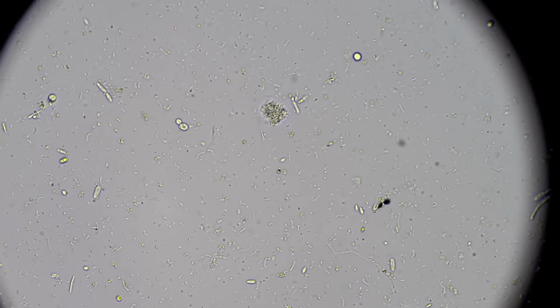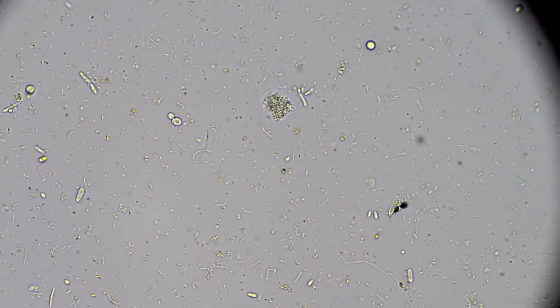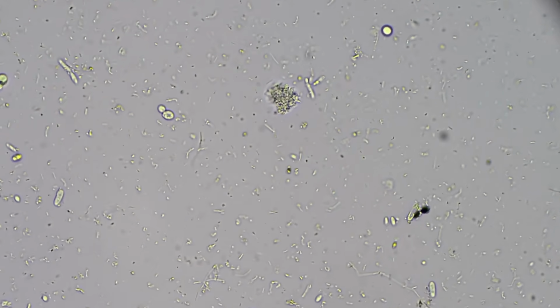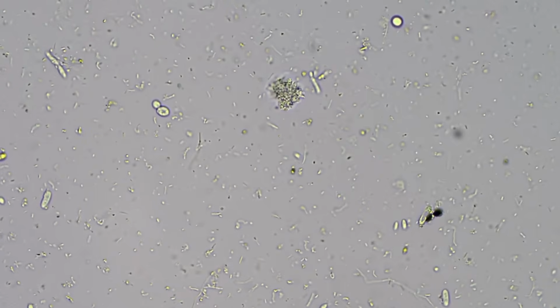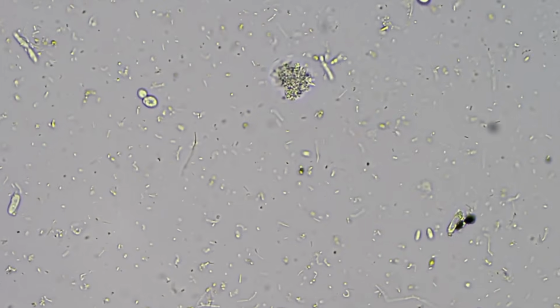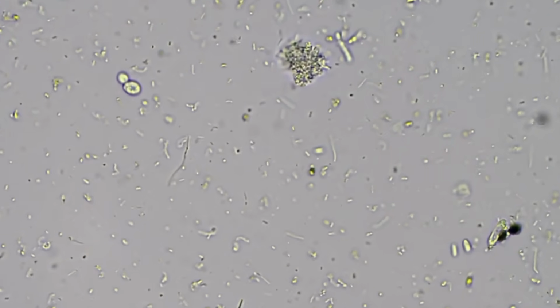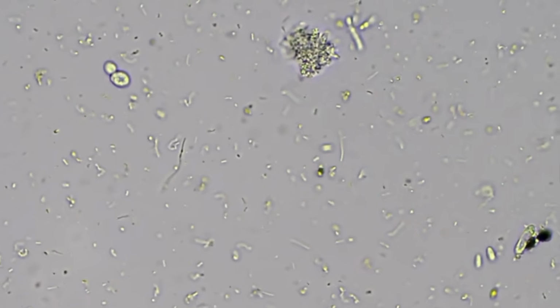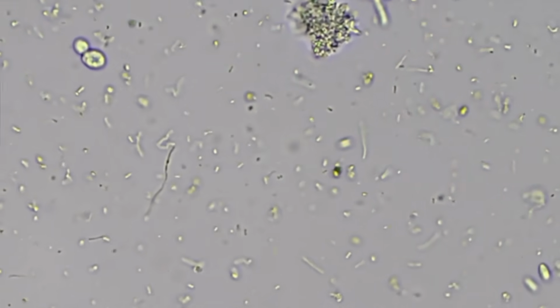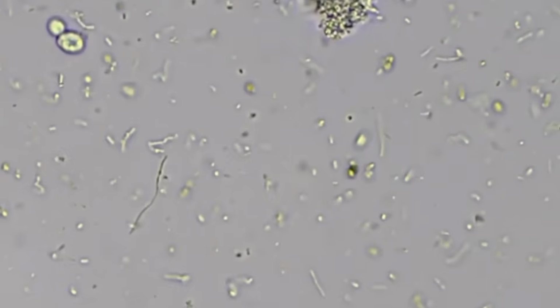But when they are vibrating against each other, that is horizontal gene transfer. They're conjugating. When they're spinning around each other and they spin off like pirouetting, kind of like in the middle right now, they were just spinning right here in the center. They're gonna look like they might do it again, but they're in each other's orbit. Bacteria have orbits, and they can hold DNA in their orbit and exchange DNA through each other's orbits. So when they're pirouetting around each other and then spin off like galaxies that almost collide, that is what's going on there.